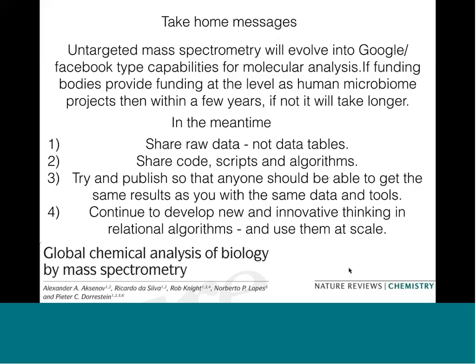We should also really make sure that we share codes, scripts, and algorithms of any analysis that we do, because this is how we make sure that the data in papers are reproducible. We should also try to really publish so that anybody who takes your data should be able to get the same results with your data if they use the same tools.